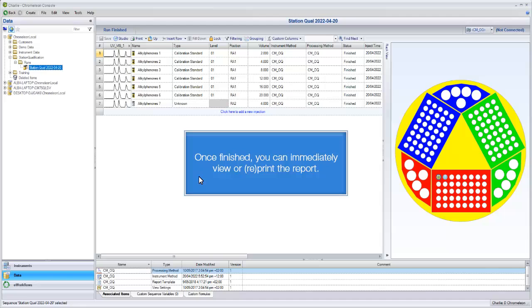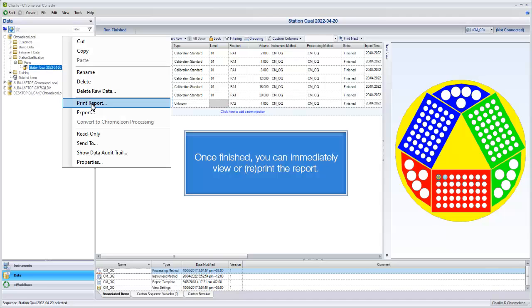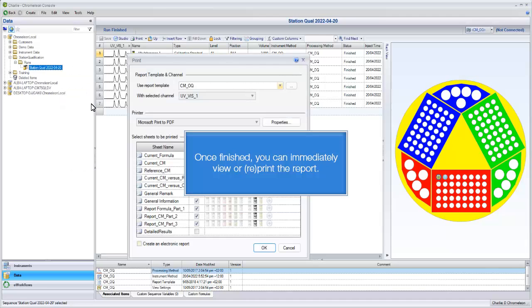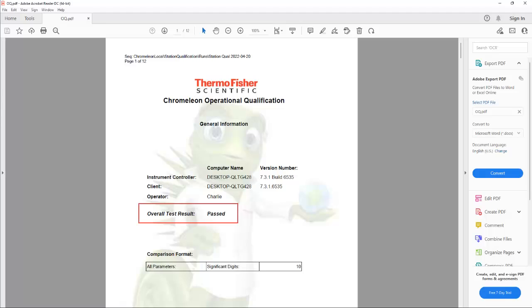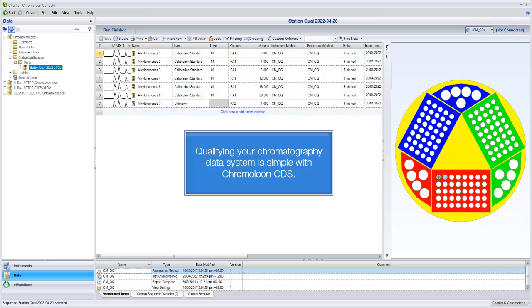Once finished, you can immediately view or reprint the report. Qualifying your chromatography data system is simple with Chromeleon CDS.